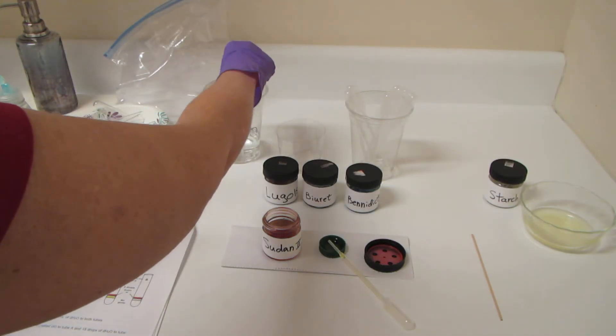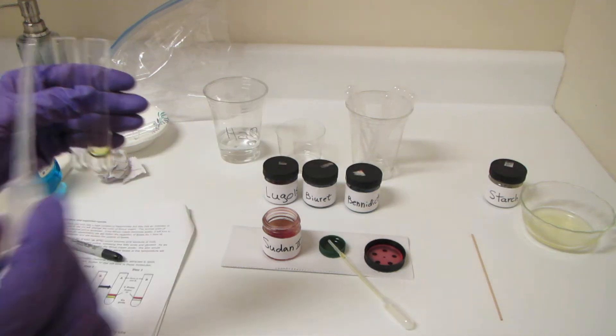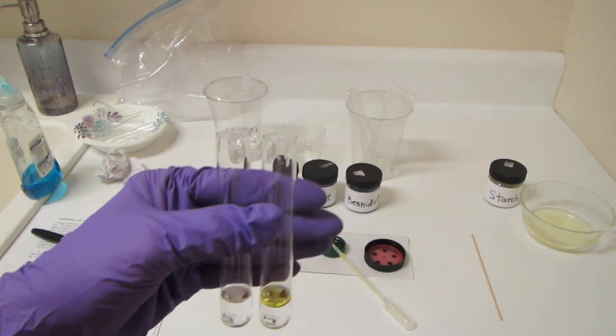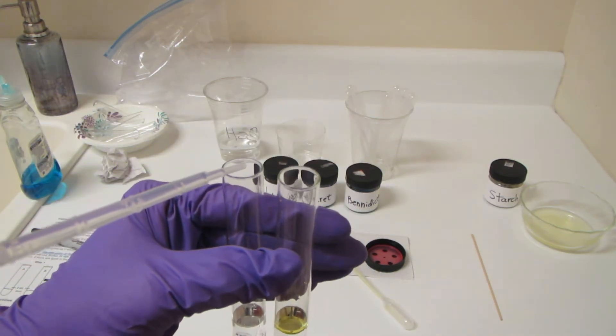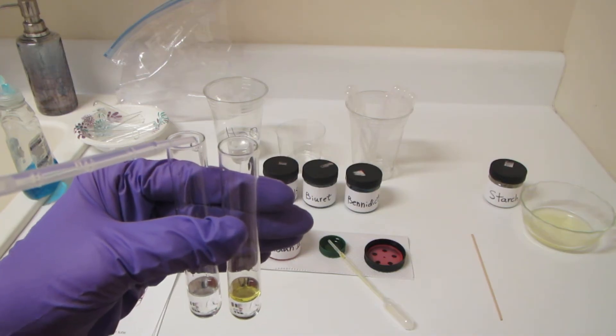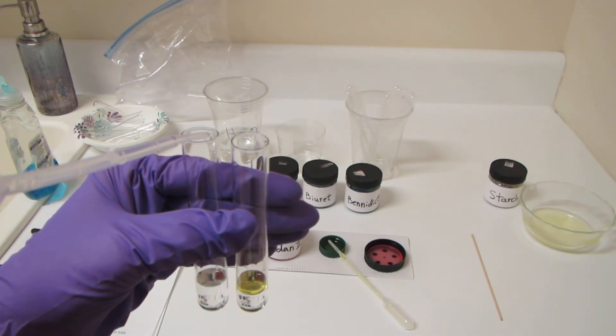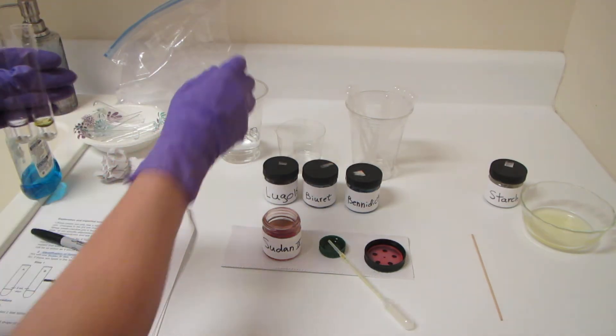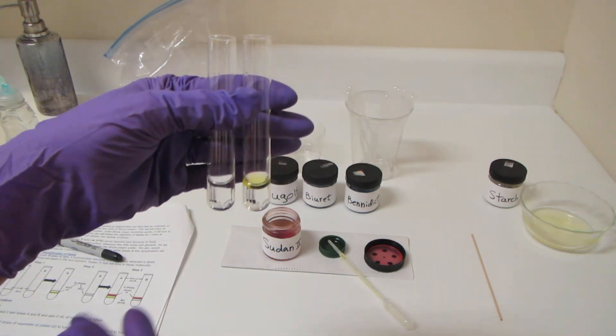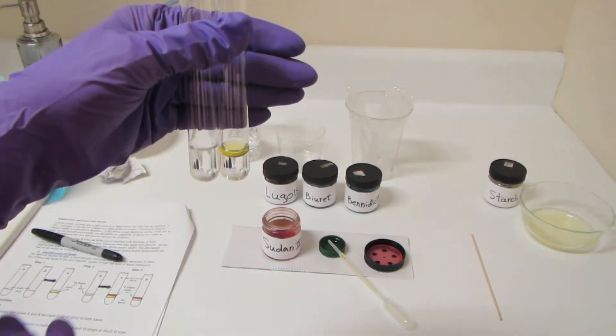Now, to make this perfectly even steven, the tube that does not contain the vegetable oil, I'll put 15 drops of water in. So now, both of these tubes contain the same amount of liquid.